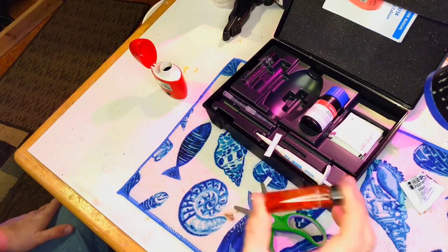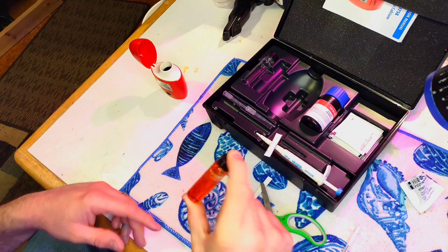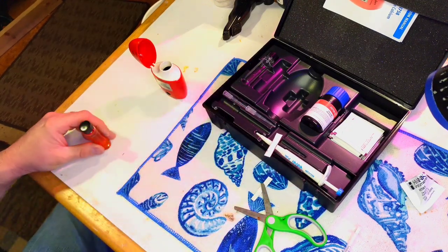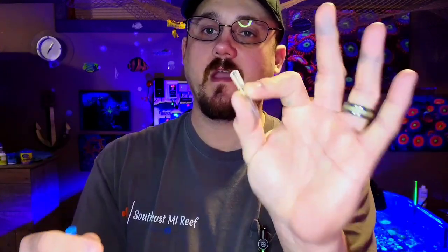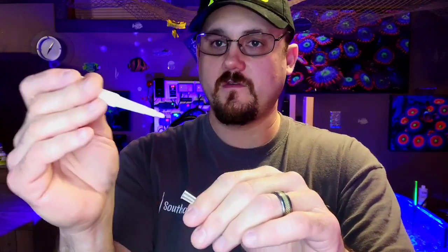Once everything is in, you're going to want to shake this one — unlike the alkalinity test, you do shake the calcium vial. Just shake lightly to make it uniform. Now let's go to the tank and I'll show you the water sampling part. This is the instrument you'll use to get your tank sample. It's a very small sample and you must use the provided tip — make sure you put the tip on, don't use it by itself.